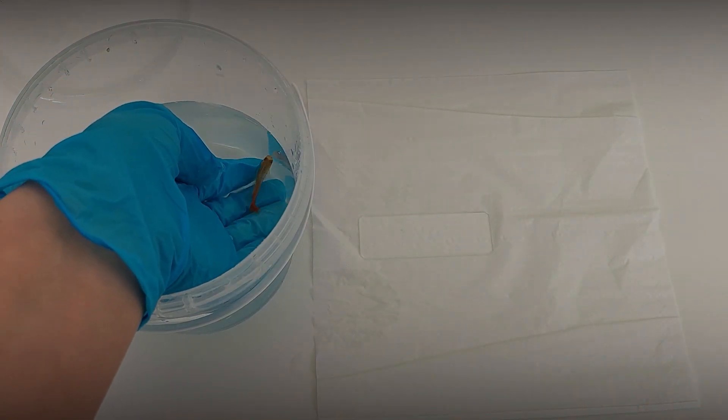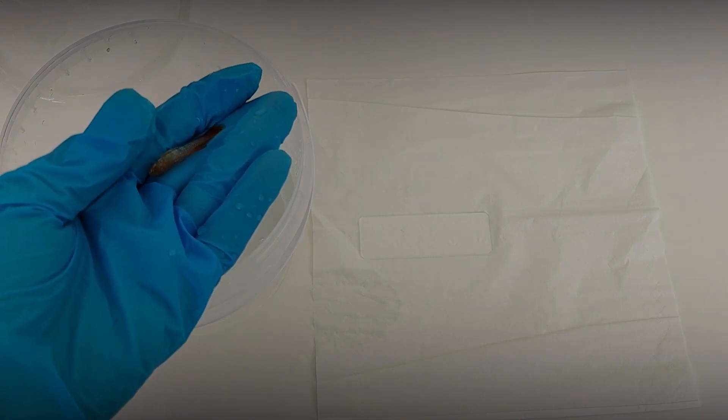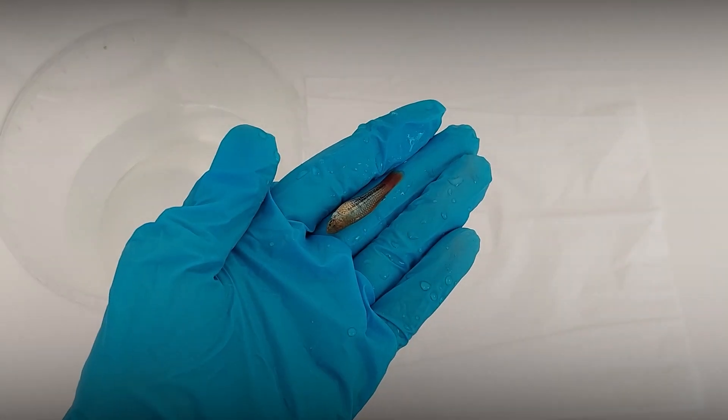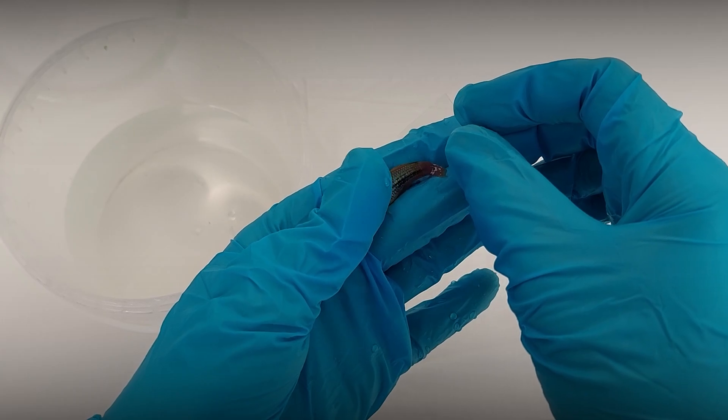Carefully remove the fish from the container. This can also be done with a net. Hold the fish so that it can be scraped from head to tail, depending on whether you are left or right-handed.